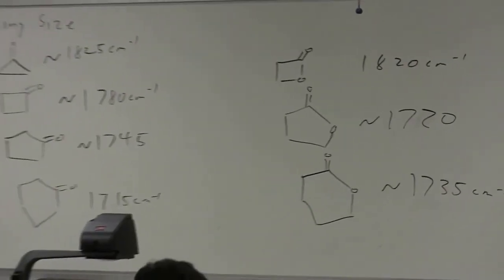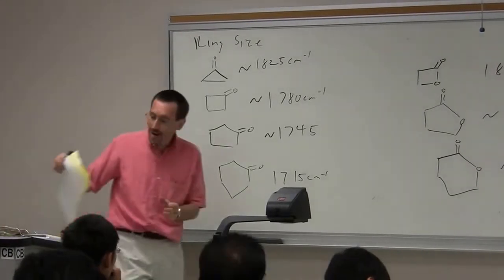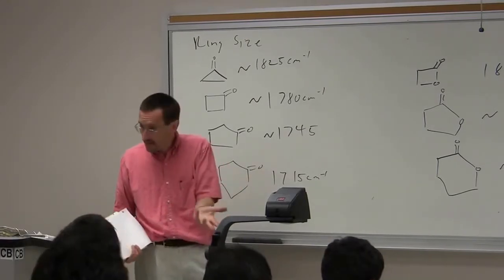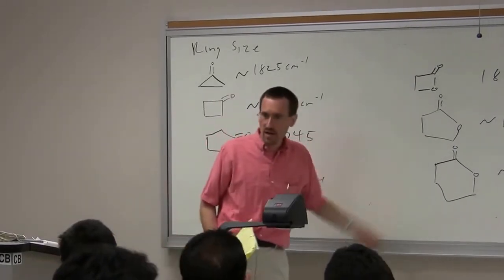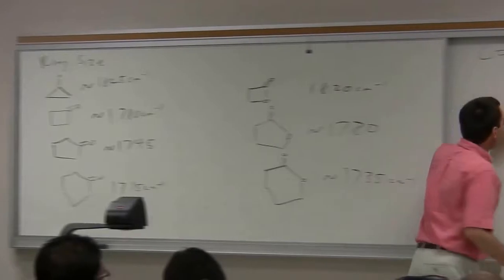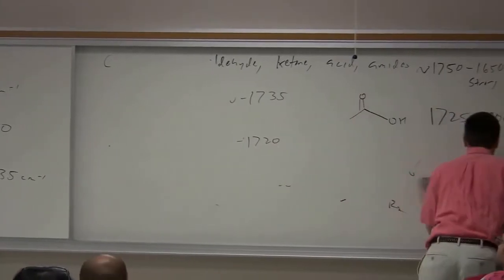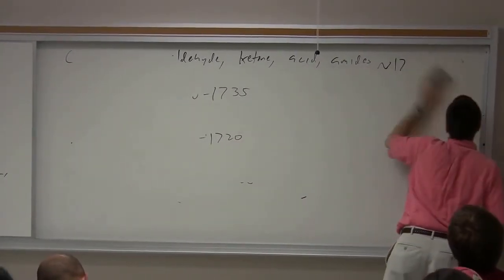Now remember, when you're carrying out reactions to make molecules, you're not just corroborating what you think you've done, you're actually asking the question. I had a hypothesis: if I mix this stuff, I'm going to form this. And sometimes you get a surprise, and it teaches you something. So that's ring size, and that is something that IR really shines at. Let's talk about something else. Let's talk about conjugation.